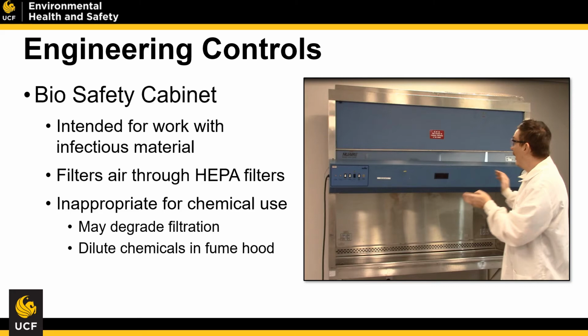So please, if you're going to work with chemicals inside of a biosafety cabinet, make sure that you've diluted those inside the fume hood first. Biosafety cabinets should only be used for infectious materials.